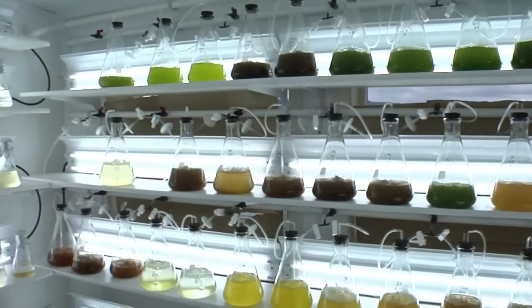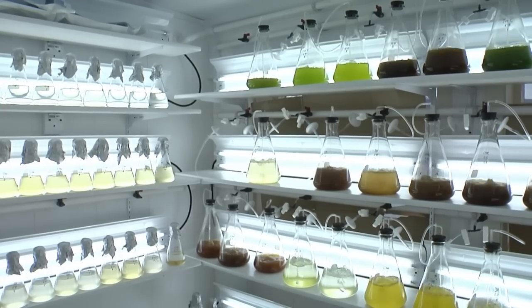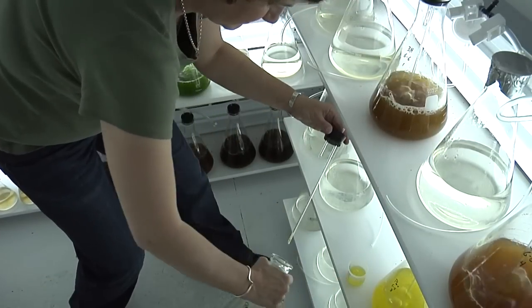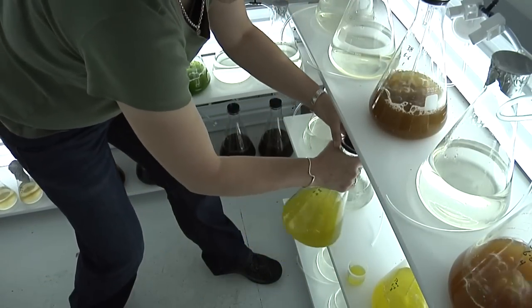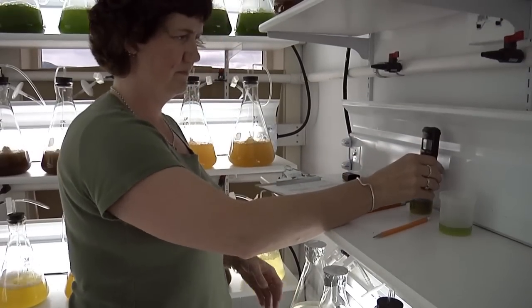This room is monitored for temperature because they're very temperature sensitive. We also monitor several times a day, coming in to take the pH sampling of our large flasks just to monitor how the pH is changing throughout the day.